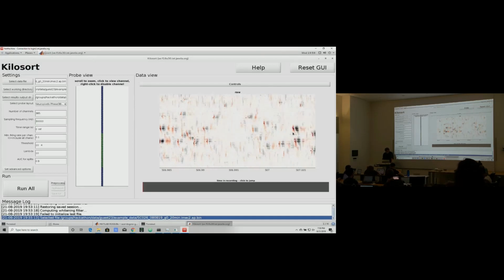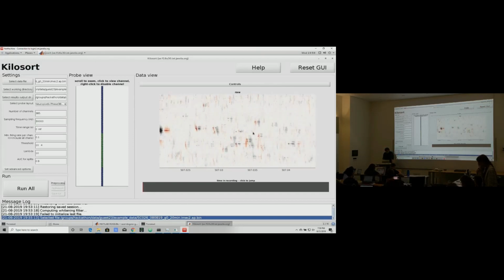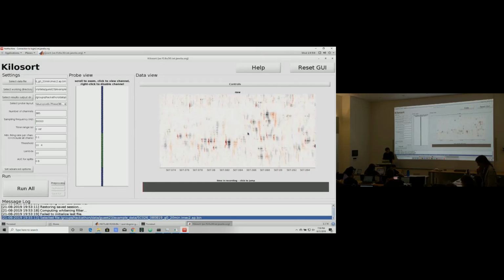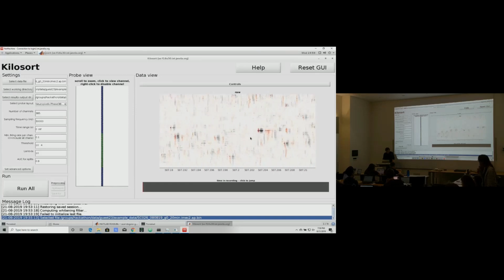Okay, we get an idea. So now, if we can see spikes and they look like there are many channels consecutively, then we kind of already know that it must have loaded the data correctly. Okay, and so the scroll wheel alone is just going to scroll you through the data, left, right. Look at all these beautiful spikes that Susu collected.